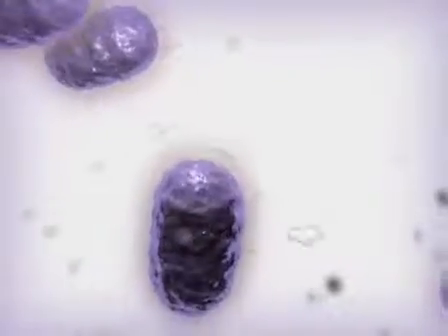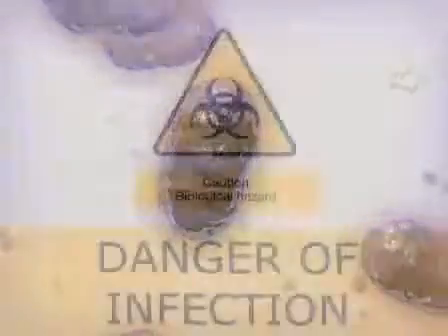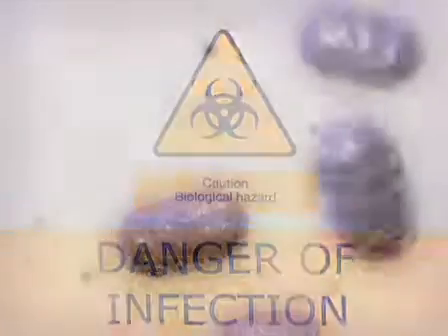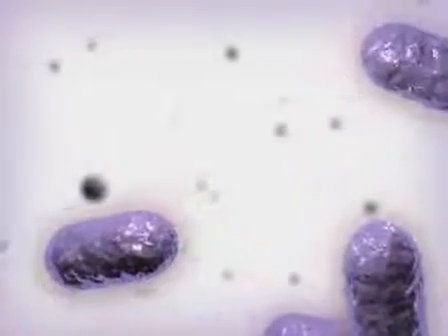Mycobacterial pathogenic strategies remain poorly understood. The slow growth rate of most species, the impenetrable nature of the cell wall, and the hazards of working with pathogens make mycobacteria difficult to study and are largely responsible for our poor understanding of these organisms.